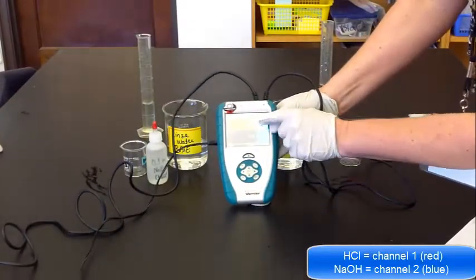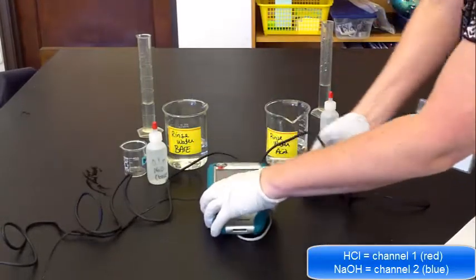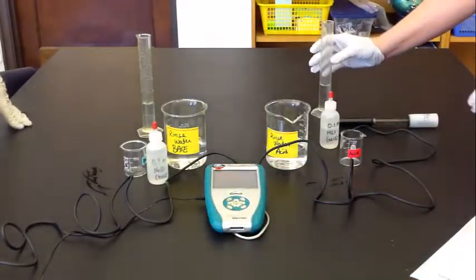And then it will display—it will say channel 1, and usually red acid, red base blue. People remember that. Now we have our electrodes.